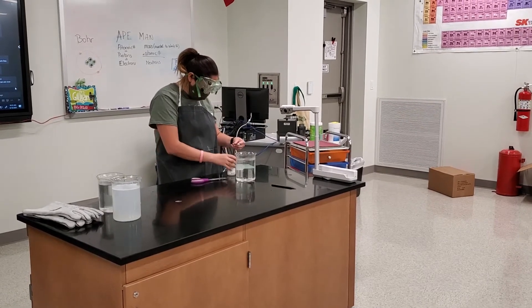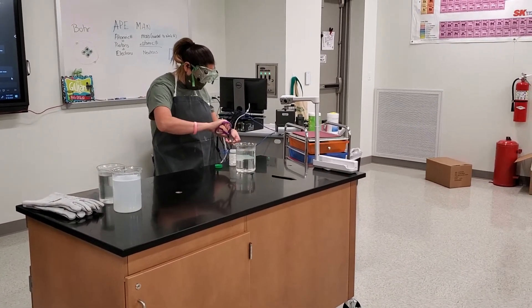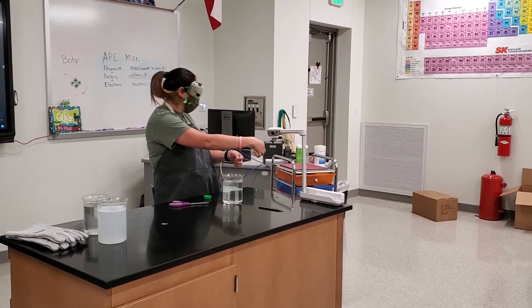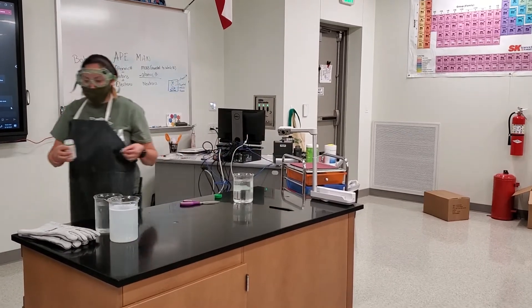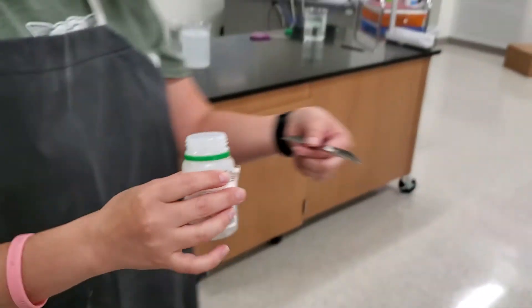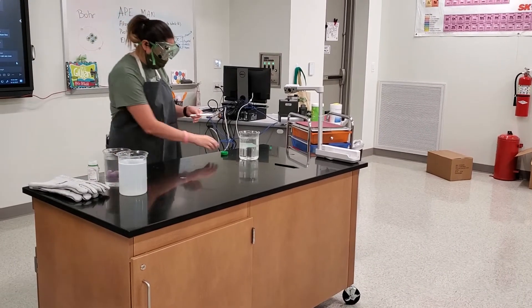I'm going to put a piece back in here, because we only need one piece. I do want to say it is also in oil — it is in oil. Okay, I'm going to show the camera over here. I'm going to go ahead and close that.